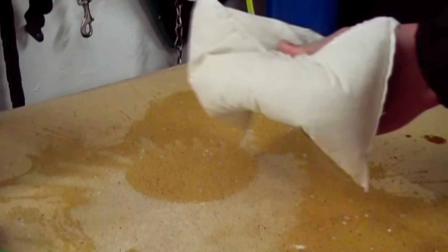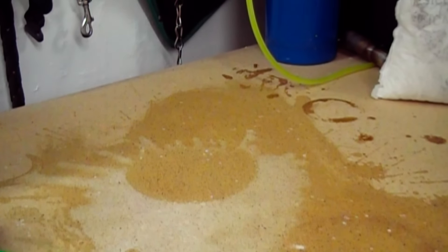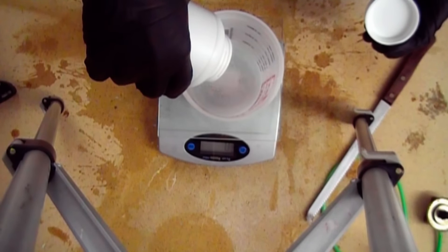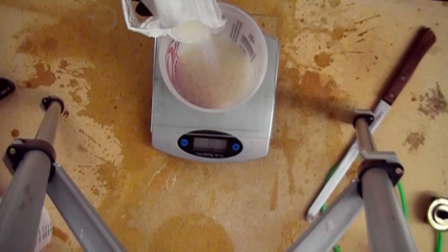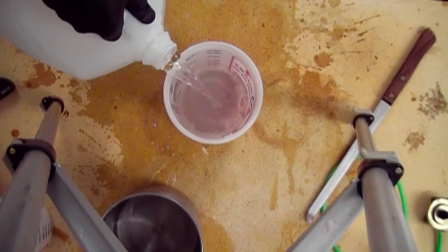I will also be using silica gel, and this can be found in these desiccant packs that absorb free moisture. I've got a bunch of these laying around. To start out with, weigh out 200 grams of sodium hydroxide. Then weigh out 300 grams of silica gel. And then measure out 500 milliliters of distilled water.